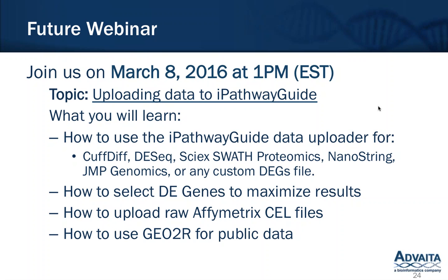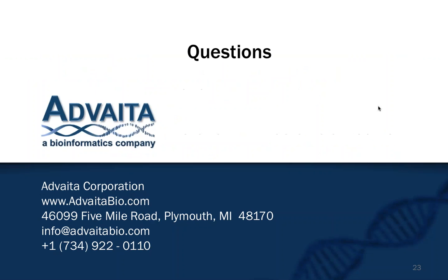We'll even highlight how you can upload raw Affymetrix CEL files, and some of the limitations and best practices that go along with that, and even show you how you can leverage public data through the GEO2R portal. It's held in NCBI. So with that, let's do some Q&A.